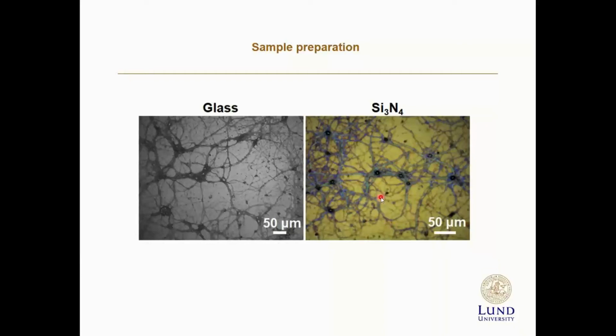Silicon nitride is the substrate that can be used for X-ray fluorescence imaging. And because optical photothermal infrared is less sensitive to substrate in reflection mode, neurons could also be examined using optical photothermal infrared spectroscopy.